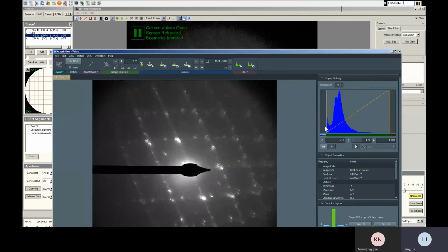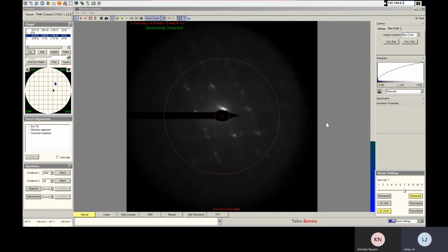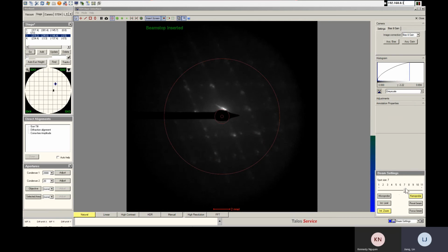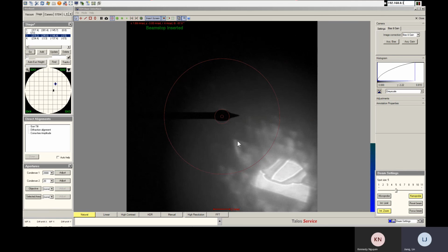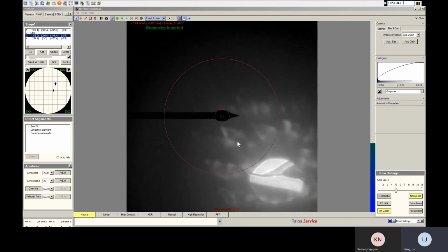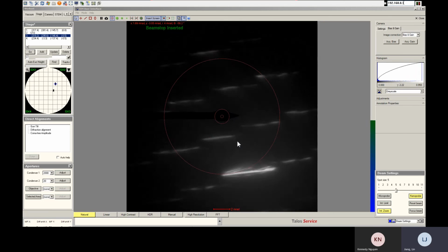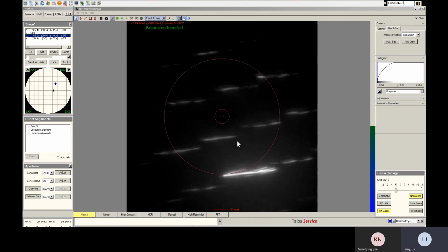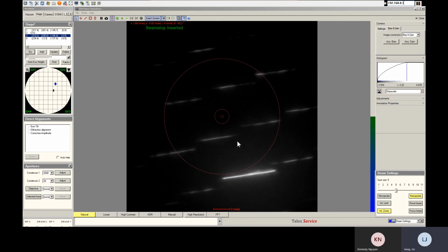I think that's the best we can do right now. I think we can further enhance it, use even smaller spots, or even larger spots actually, because the beam is very weak. Oh, you get another condenser. Let's go.